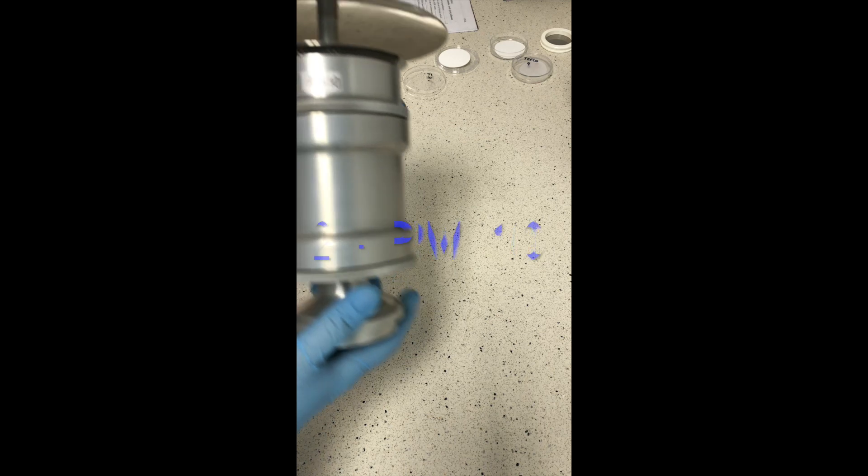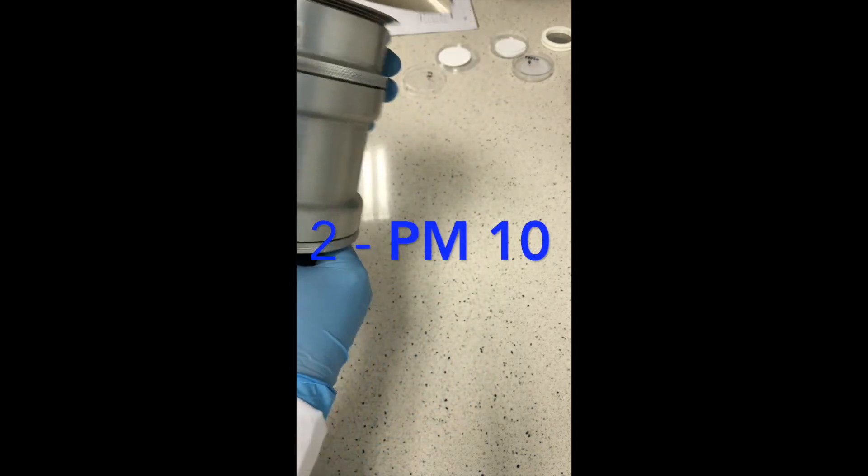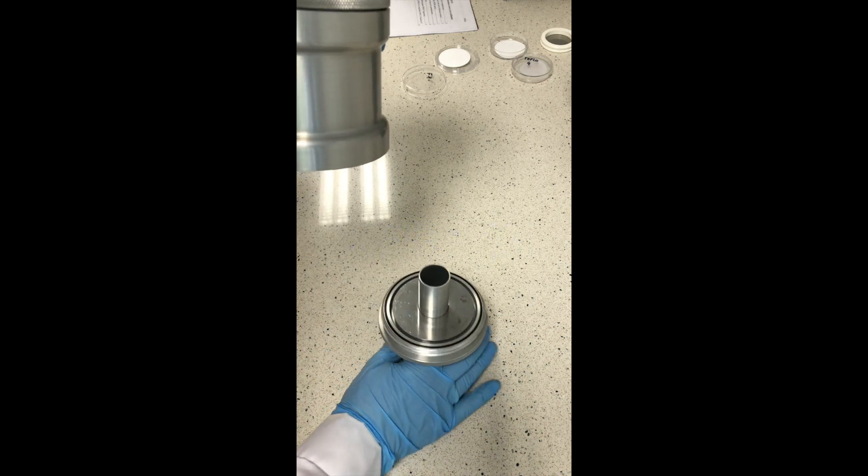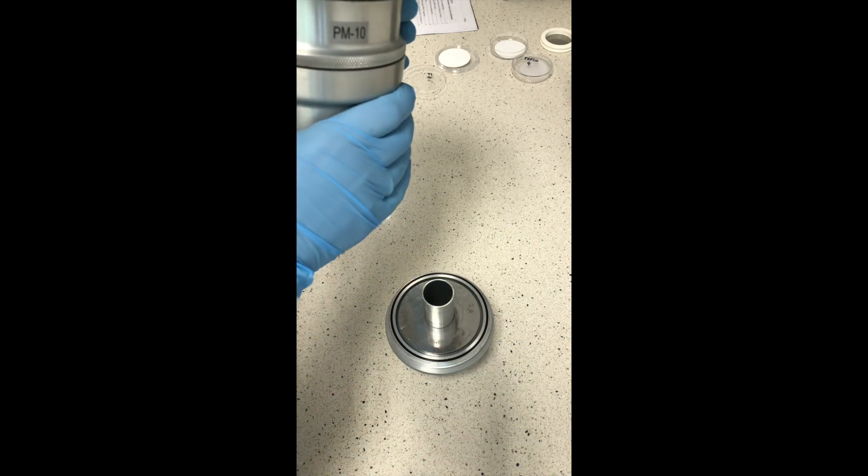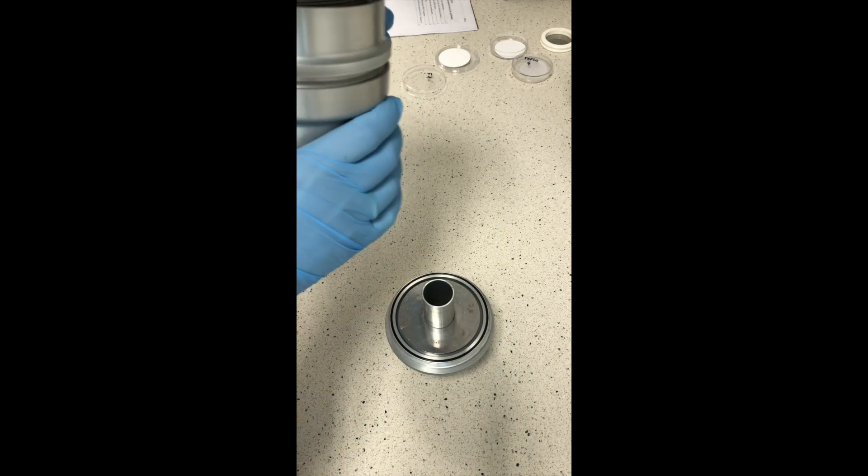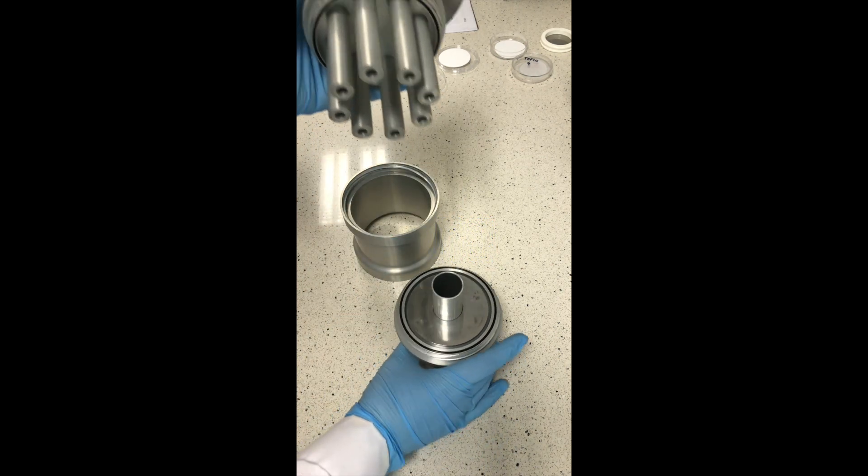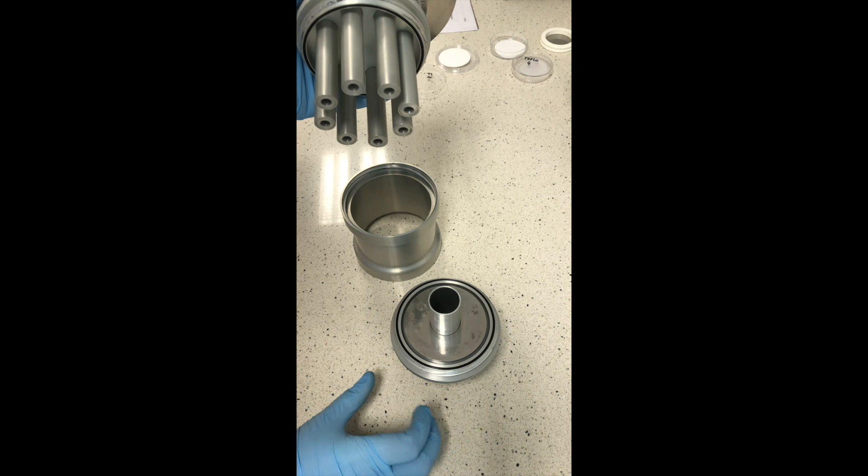The second one is PM10. So we have the head which is collecting the samples, the particles lower than 10 micrometers. And it looks like this.